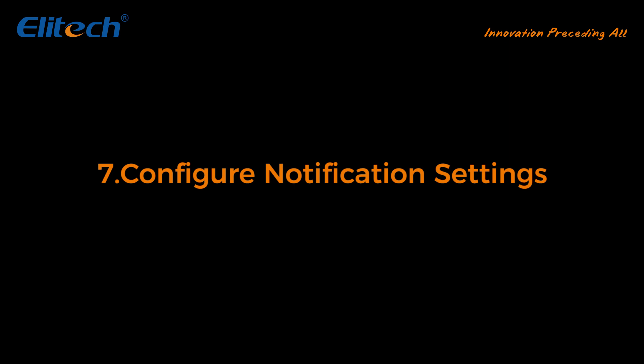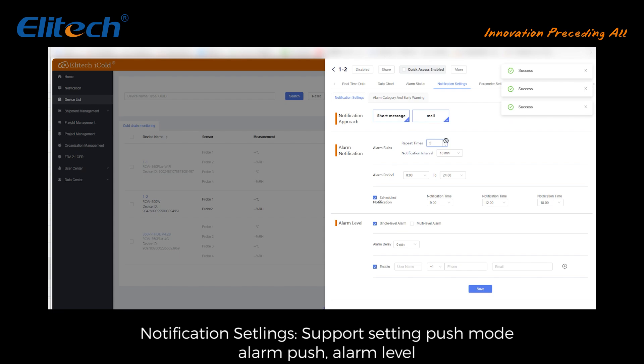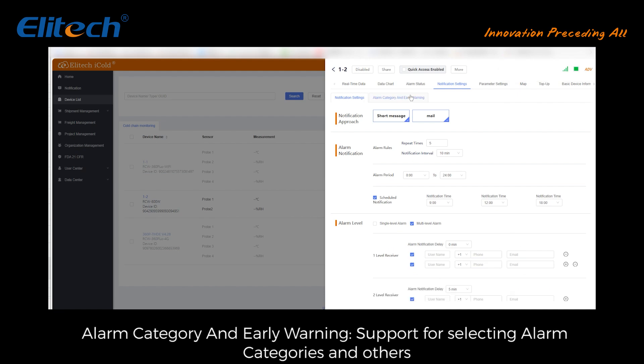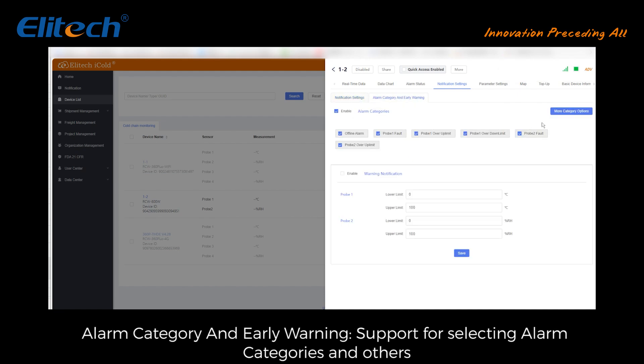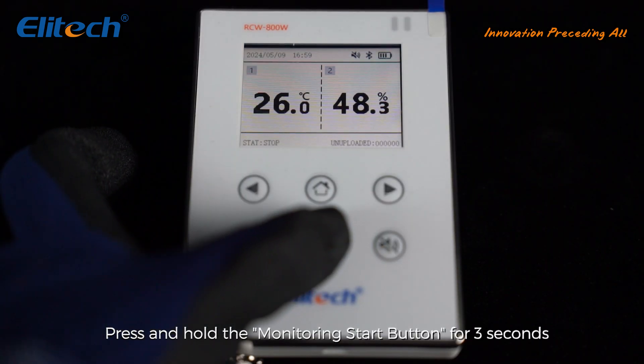Configure notification settings: click notification settings to open the notification settings panel. Supports setting push mode, alarm category, and early warning. Supports selecting alarm categories and other notification options.